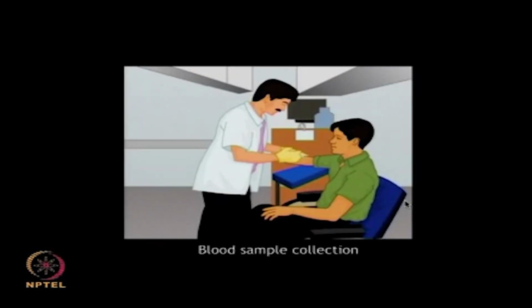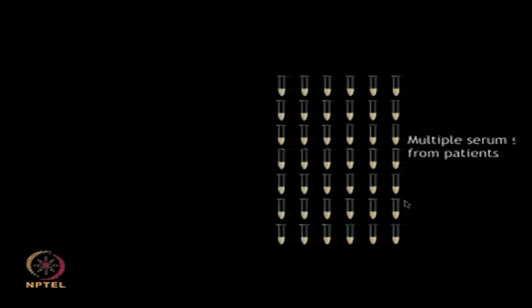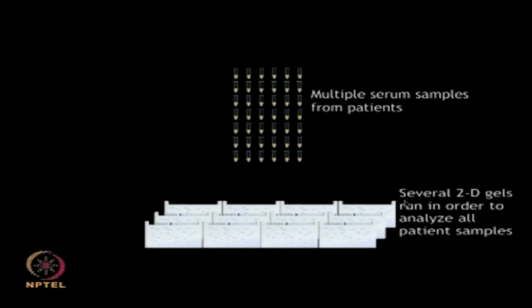Two-dimensional electrophoresis, although it is a very useful technique, may not be the best option in this case for analysis of serum proteins obtained from a large number of patients, as it would involve running several individual gels, which would be a very time consuming process. Also, there will be variations across the gels, which would make comparison very tedious.